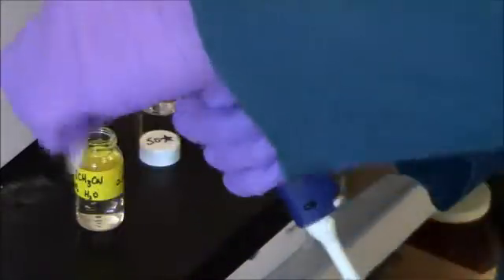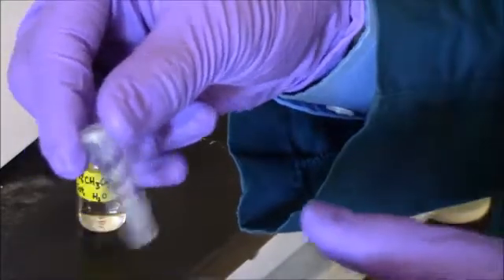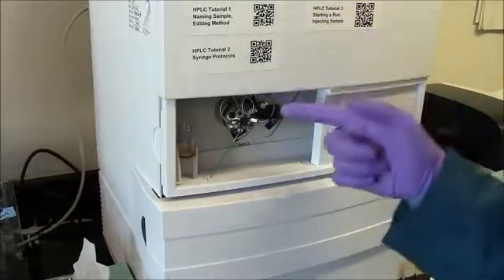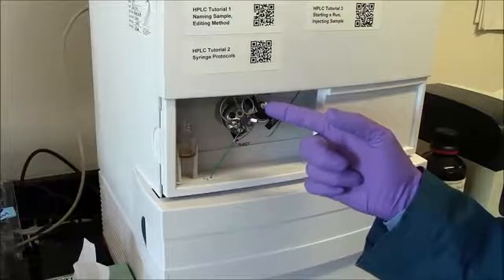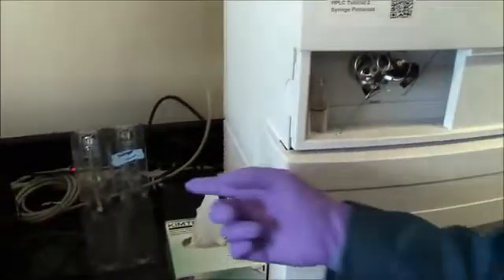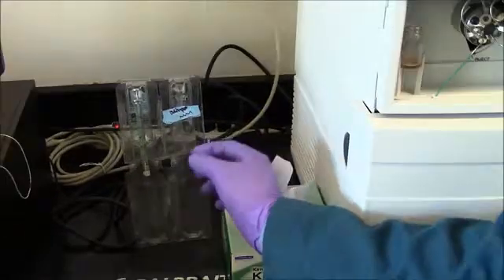And I just agitate that gently. Here's my sample ready for injection. It's got a label on it, so I know what it is. The injection port on the HPLC is right here. We have a manual injector, so I need to get a syringe, which is over here. So the syringes are always next to the HPLC.